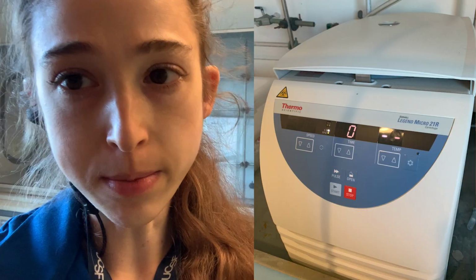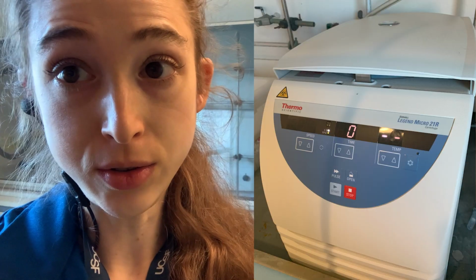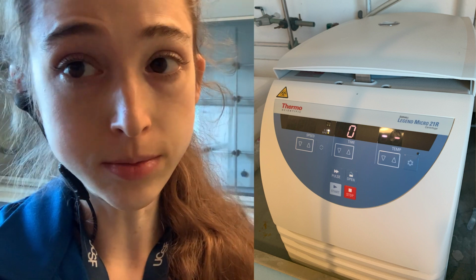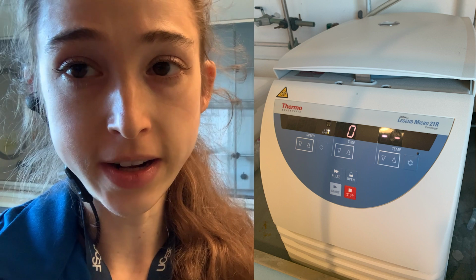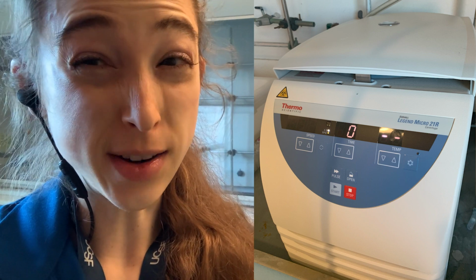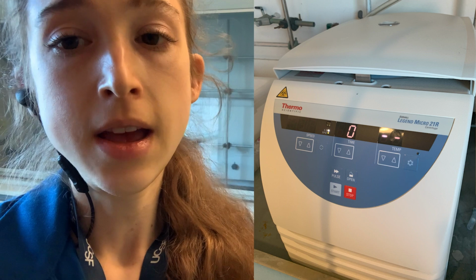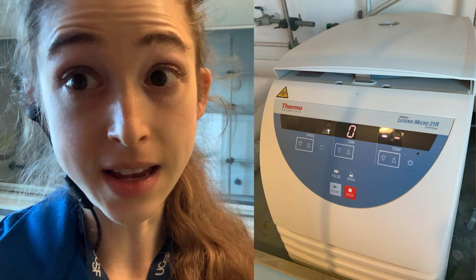Not really incubating, but if you need to centrifuge, so spin tubes really, really fast and keep them cold, we have centrifuges. Some of them are refrigerated, and so you'll see typically an R at the end of the name for refrigerated. So they often have versions that are refrigerated and non-refrigerated, and the refrigerated one will have the R at the end. These will keep things cold, but they take a while to actually get cold, especially the bigger ones.